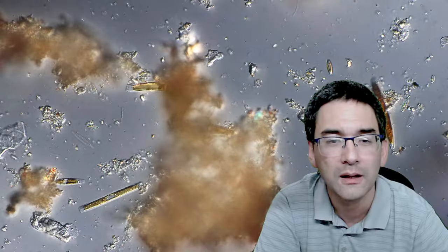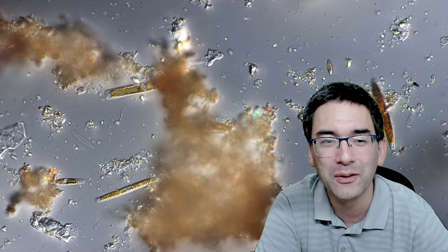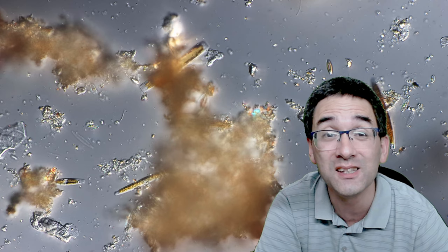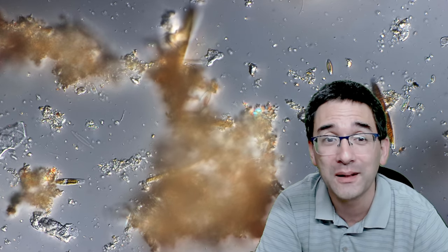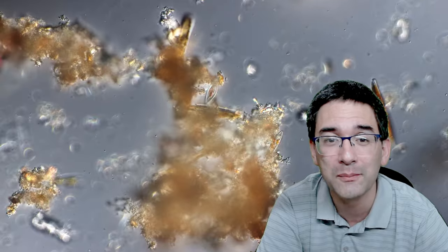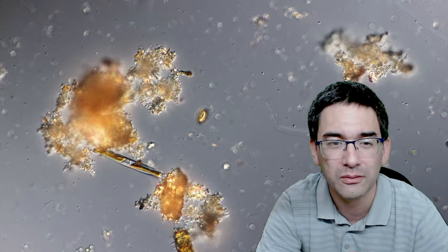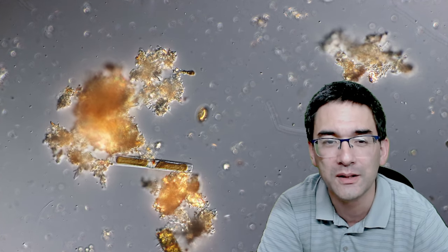So let's do the following. I decided then, let's go up with the magnification way more. And here, I'm back again. I wanted to have a closer look at some of the gliding motions of those diatoms. This is now not in time-lapse, just regular speed. They like to move around. Sometimes when they move around, they also bump into this large debris piece and they're also pushing that around as well.